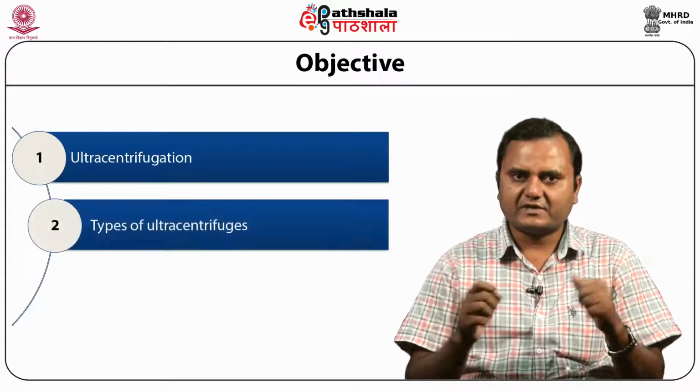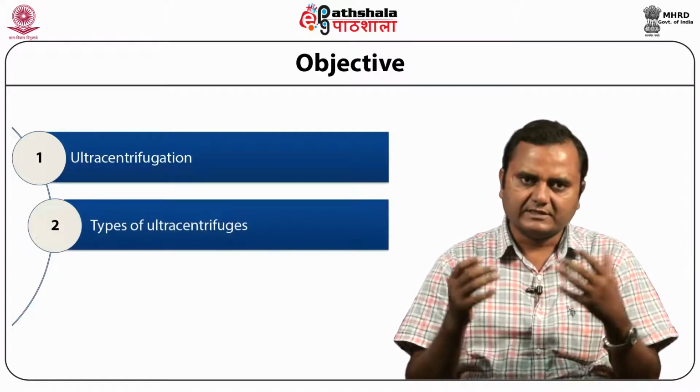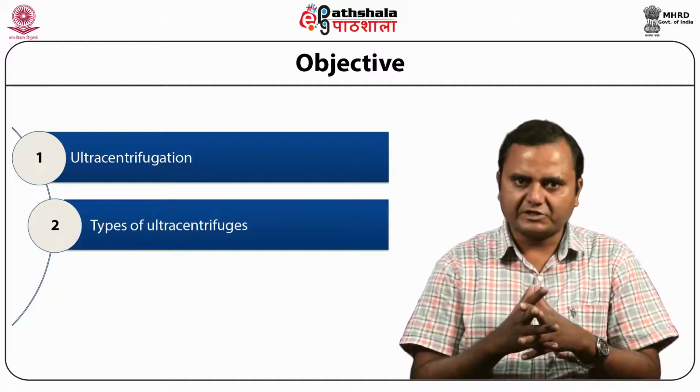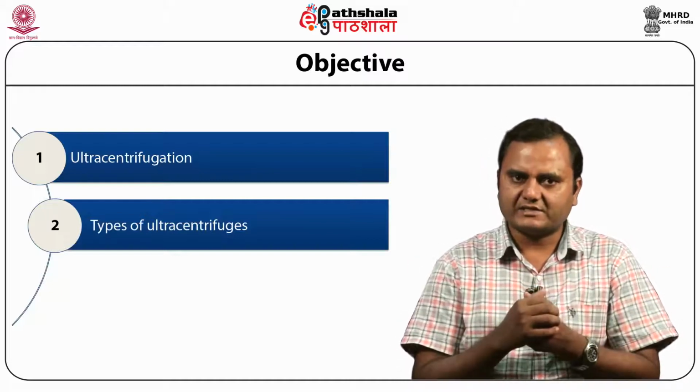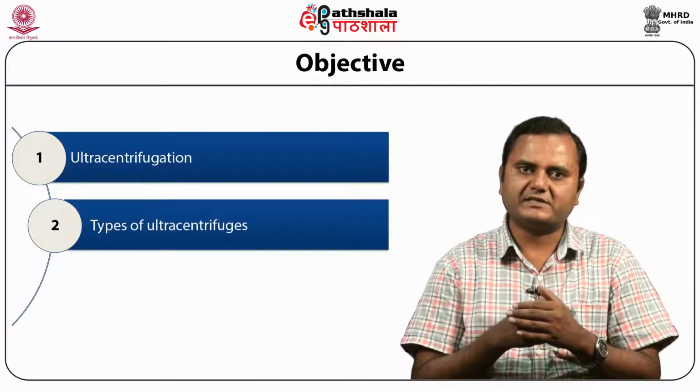Then the types of ultracentrifuge. There are two types of ultracentrifuge: one is preparative and one is analytical, based on their application. So there are two types of ultracentrifugation. We discuss a brief introduction to both these forms of ultracentrifuge.